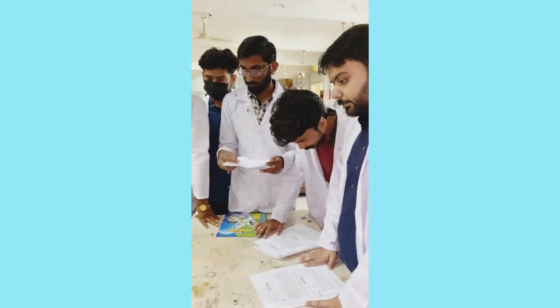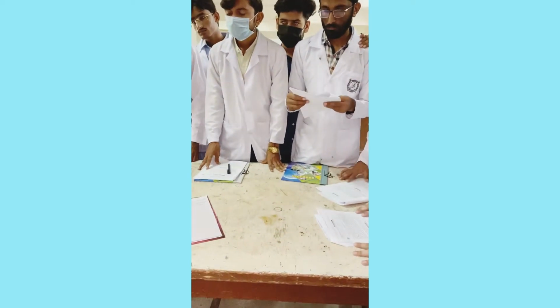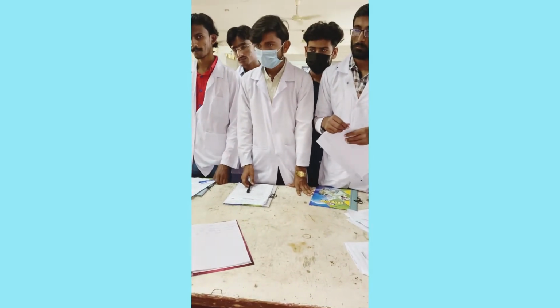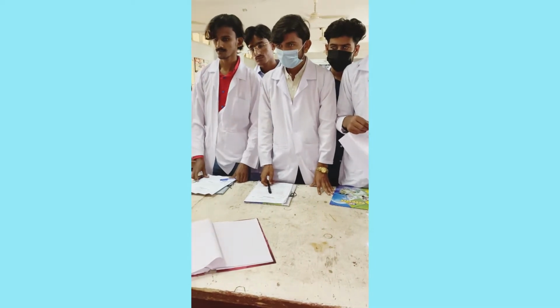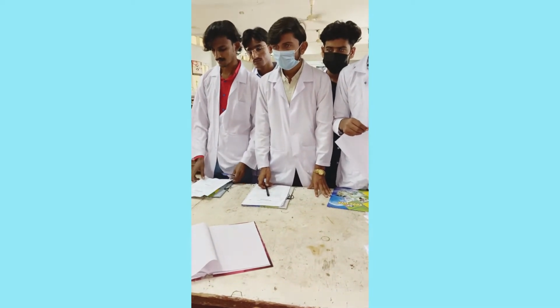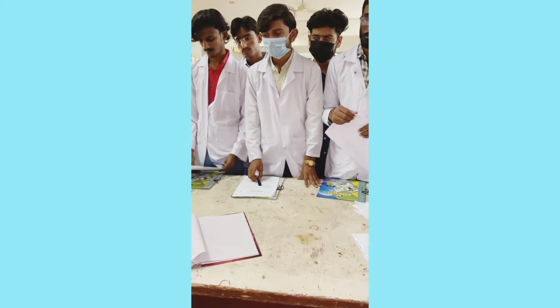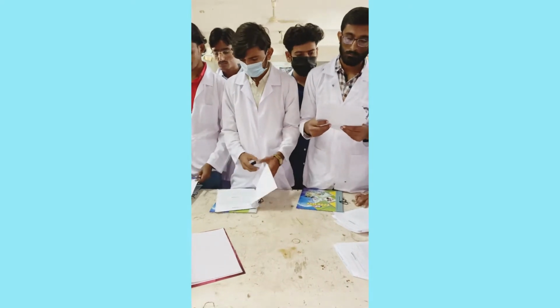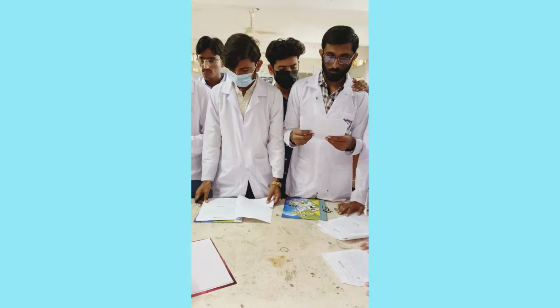Now every experiment has many steps, 4 to 5 steps. You are going to weigh the compound, then assemble the glassware, and then start the reaction, and monitor the reaction for the time period mentioned in your experiment, which is here. This is P.Nitro acetanilide, right? This is experiment number 3, but you are going to write it down as experiment number 1.